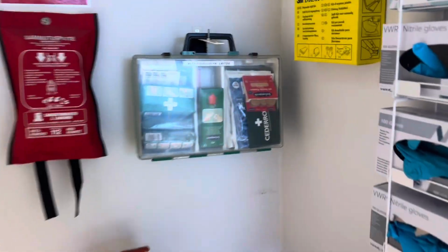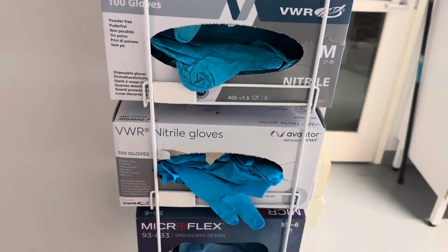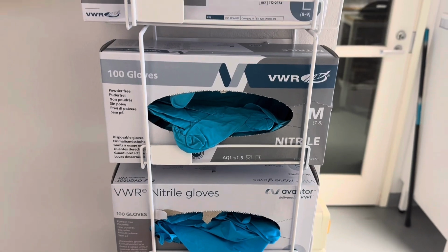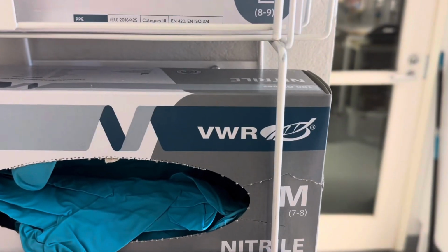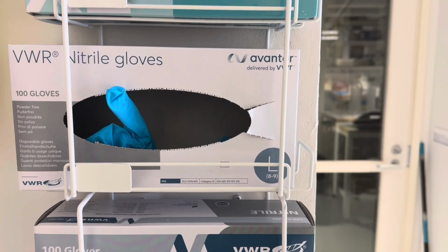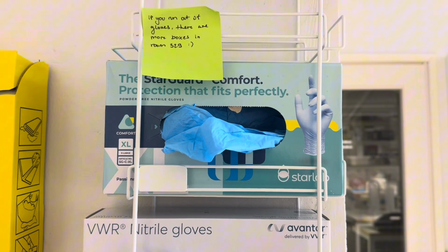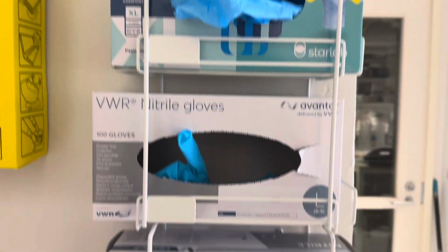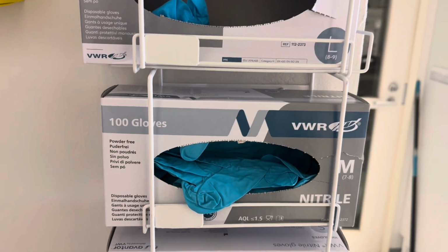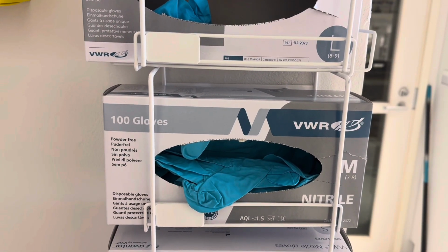Okay, the first step to start anything in the lab is to wear the gloves. So here we have different sizes of gloves, as you can see. For example, here you can see M, which means medium, and then L for large, and then there is some other sort of gloves. So you can have different kind of gloves. So this is the first step. I will wear the gloves and then I will start preparing the malt extract agar.